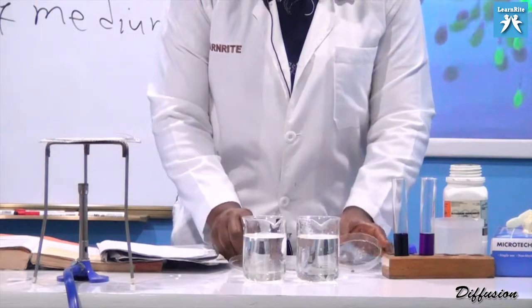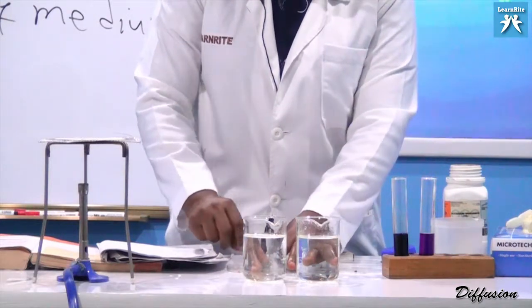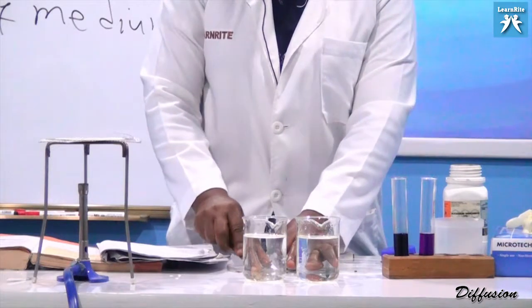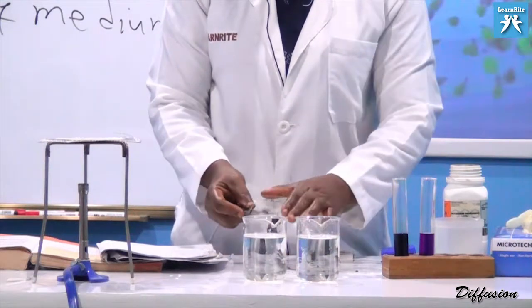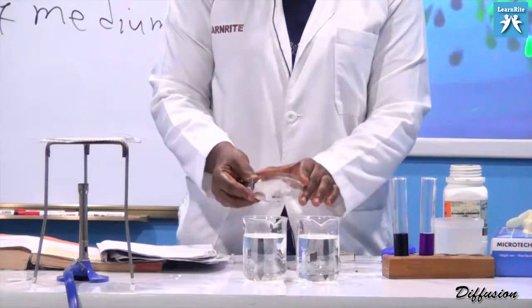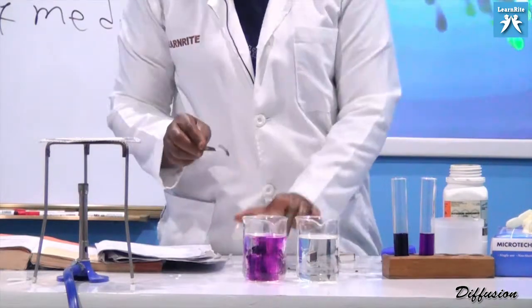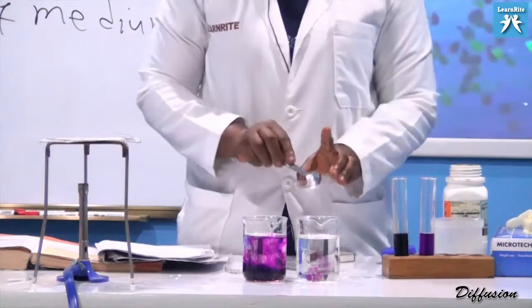Okay, then I want to grind one of them. That is this one. After that, I'll pour it into the beaker with the water. Remember, we've established that diffusion can take place in liquid. So I've turned it into a powdery form. I want to pour it into this beaker, then observe it gradually, whilst I take the one in the pebble form into the first beaker, then observe them.